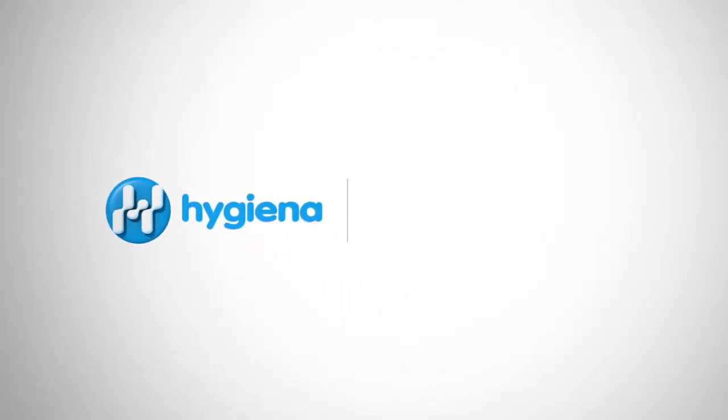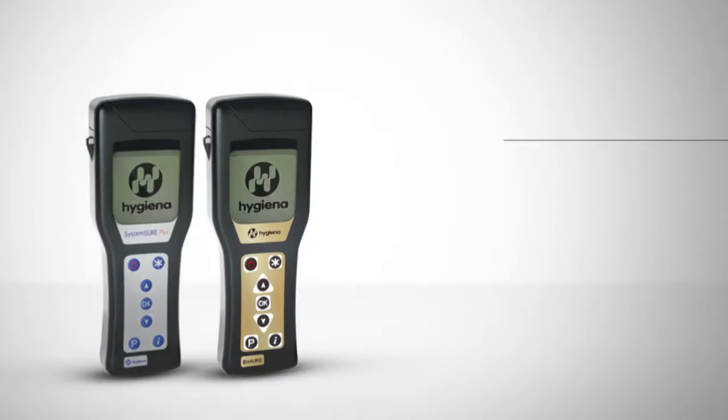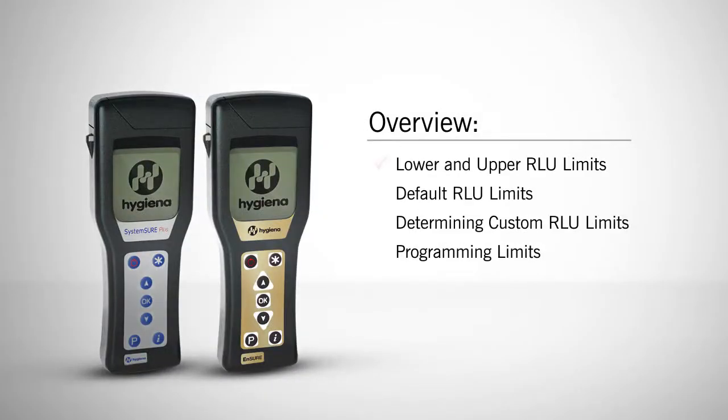Welcome to the EnSURE and SystemSure Plus tutorial for setting ATP pass-fail limits for the food and beverage industries. In this video, we will cover lower and upper RLU limits, default limits on your systems, how to determine custom limits, and how to program those limits. Let's get started. The first section is lower and upper RLU limits.